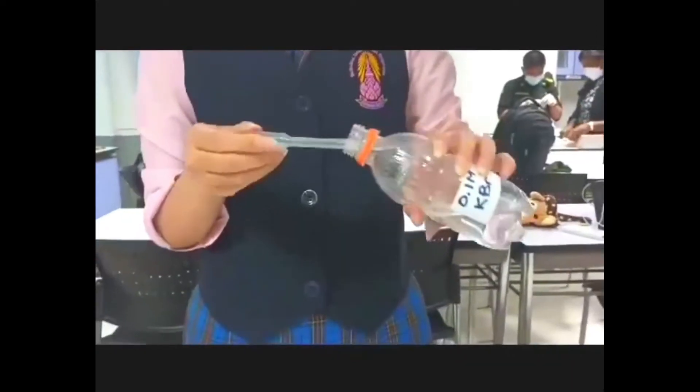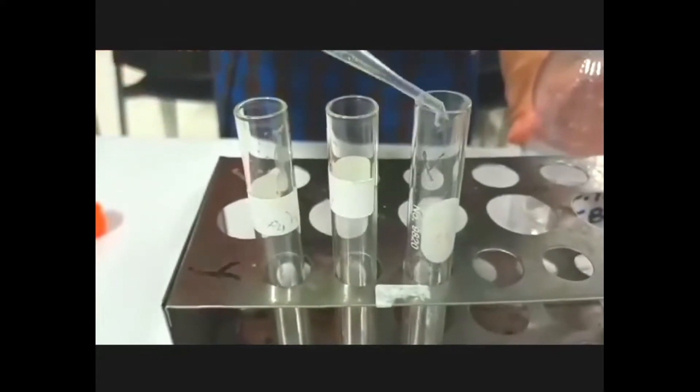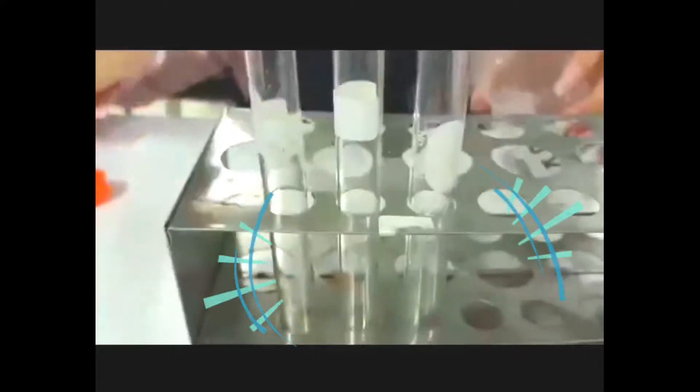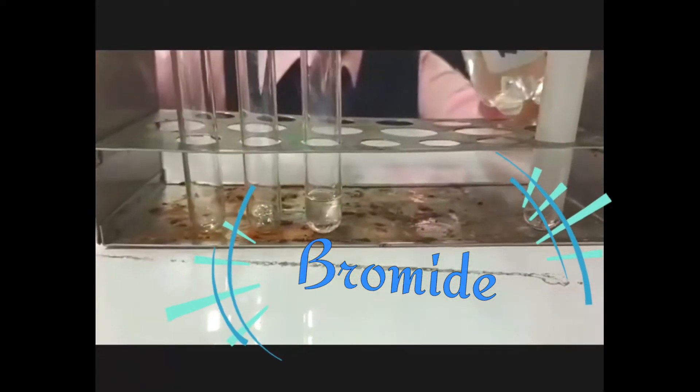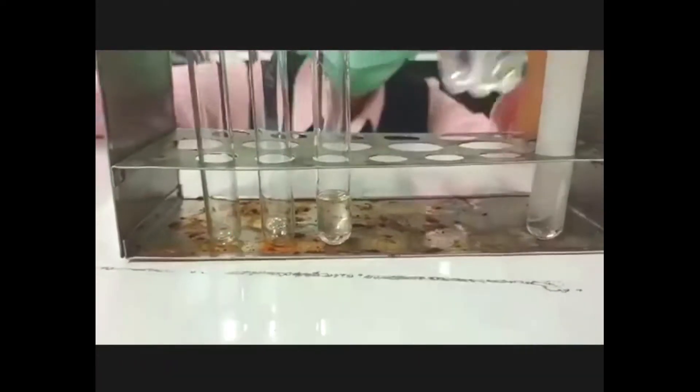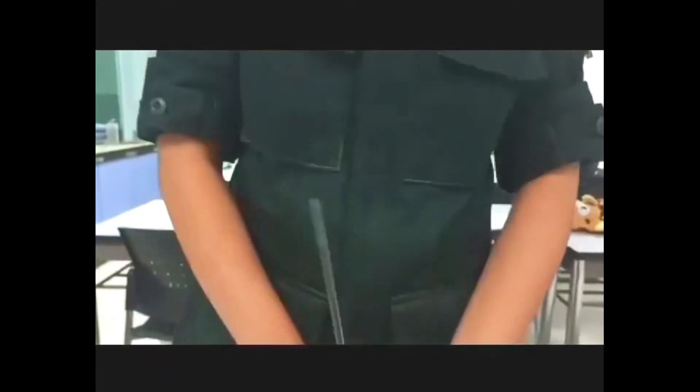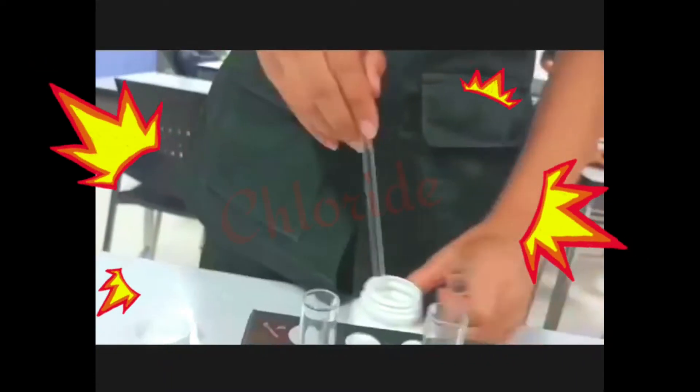Now we know that this test tube contains halide. For the first one, we're going to add some bromide. For the second one, we're going to add some sodium chloride.